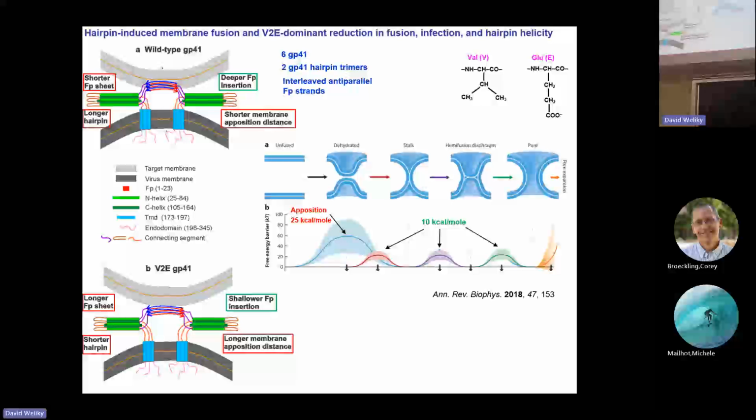In the membrane protein world, at least by NMR, there's very little work done in vesicles. So what is the membrane mimetic? For a long time it was detergent micelles, simply because they're small enough that you could still get rapid tumbling. There's some work on bicelles, where you typically still have lots of detergent, and a little bit in nanodiscs. But the bigger the object that holds the lipid, the more the tumbling slows down and lines broaden, and you're in this intermediate exchange. So you can't make the vesicles smaller.